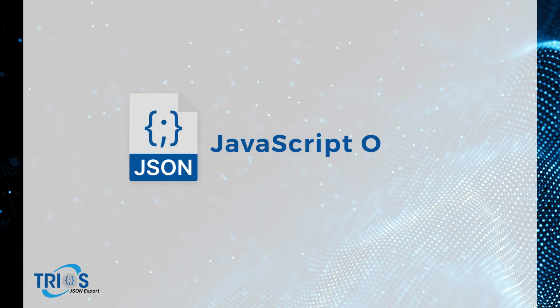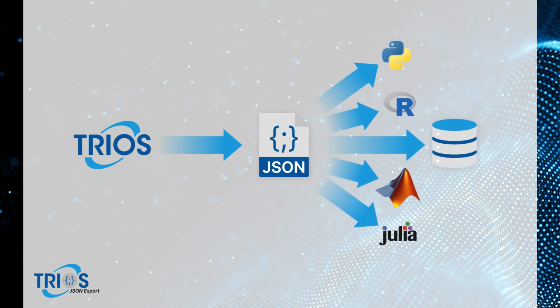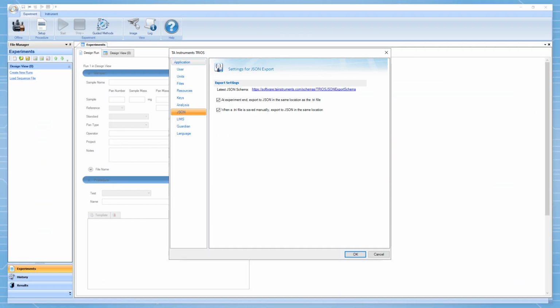JSON, or JavaScript Object Notation, is a format that makes data easy to read and write not just for us, but also for computers. It's incredibly versatile, helping to seamlessly integrate your TRIOS data with other lab data tools, including LIMS systems and databases. Let's explore how you can leverage JSON Export in TRIOS.